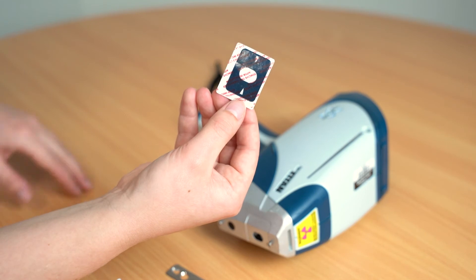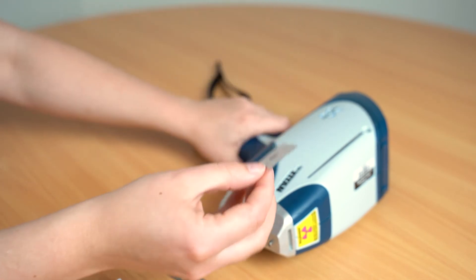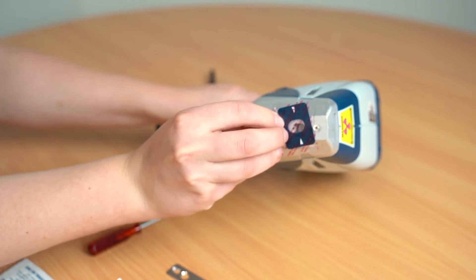Once it is sufficiently air dried, grab your new window, peel off the backing and stick it down. Screw the metal plate back on and there you have it — a new window.